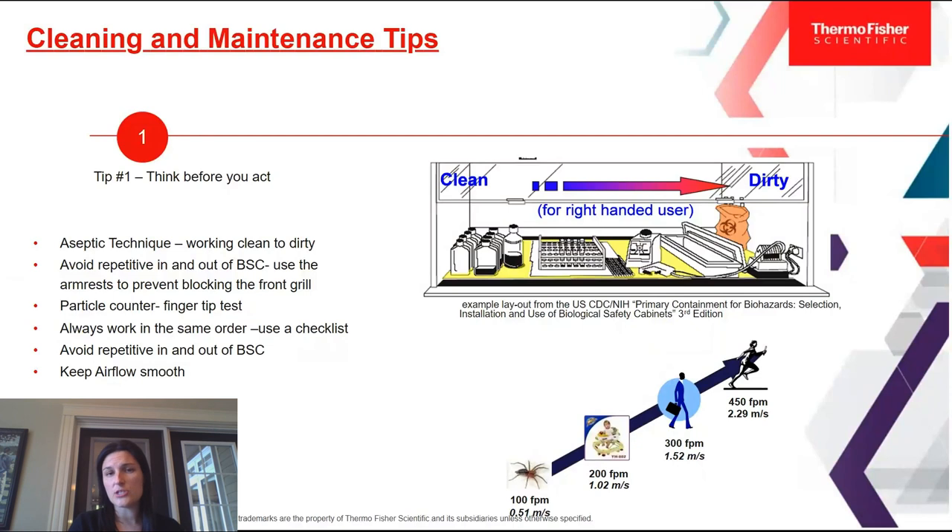Another thing that many CGT or GMP facilities use is a particle counter — a counter that sits outside your biosafety cabinet with a probe running into the cabinet. You can have it integrated into your BSC or run it through the smart port. We recommend a fingertip test: hold the probe up, rub your gloved fingers together, and if your hands are a little dirty, particles will come off and be detected by the probe, helping you know whether you're maintaining a sterile environment.